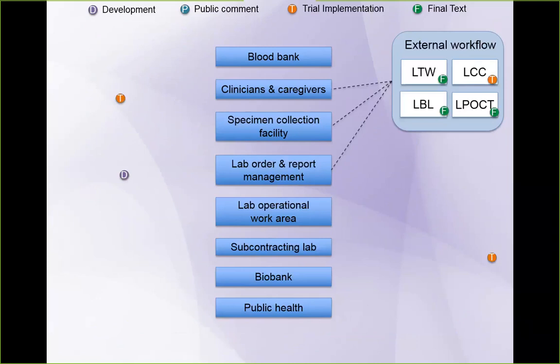So the first one, we deal with external workflows between clinicians, specimen collection facilities, and lab ordering and report management. So that's the LTW profile that deals with clinicians ordering from the laboratory, the LBL profile, which deals with labeling of specimen containers, the LPOCT profile that deals with point of care testing workflow, and then the laboratory clinical communications, or LCC profile, that deals with making adjustments to the orders that the clinicians have asked for.